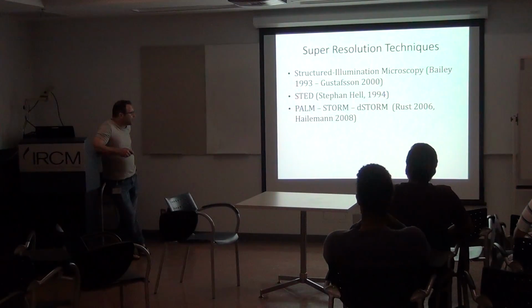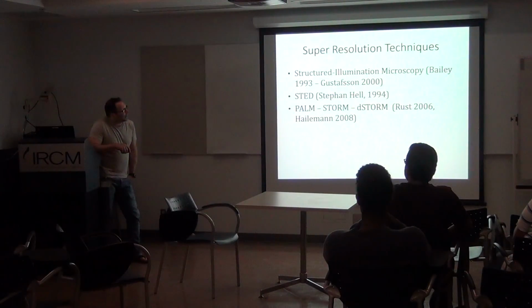And there's this STED microscopy, with which you can scan your specimen and get more details. It's a tricky way to get more details that I will explain a bit later in the slide.